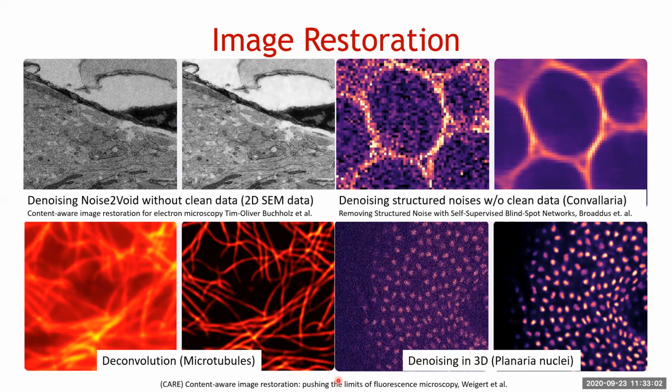So when you're sitting in front of the microscope, thinking about this, let's just say you have everything set up to do deep learning image restoration, and you have a very sensitive sample. Now, you don't want to be torching that sample to try and get something. If you're doing traditional deconvolution, you need to do at least Nyquist sampling, very dense sampling, to be able to get the pixel density and then enough data for you to do deconvolution.